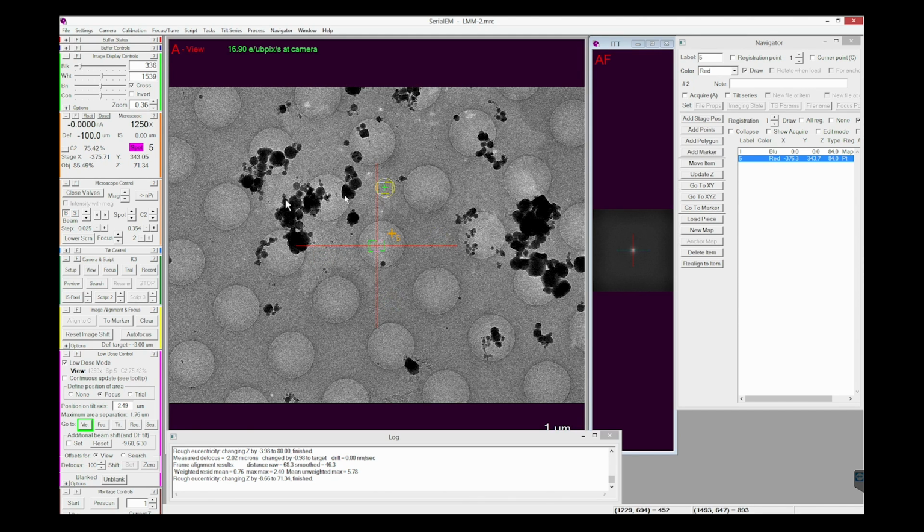Clicking around, left click sets the area that you can shift to. You don't need to shift too far. Ideally, you don't want the beam from the focus going into the hole that you're going to be imaging, but this is a decent amount of space. So something we could do is holding shift, you can then shift left click and move this between. You can see that I have 2.3 microns between each hole, so a decent amount of space. I'll then click none, and now I want to autofocus.